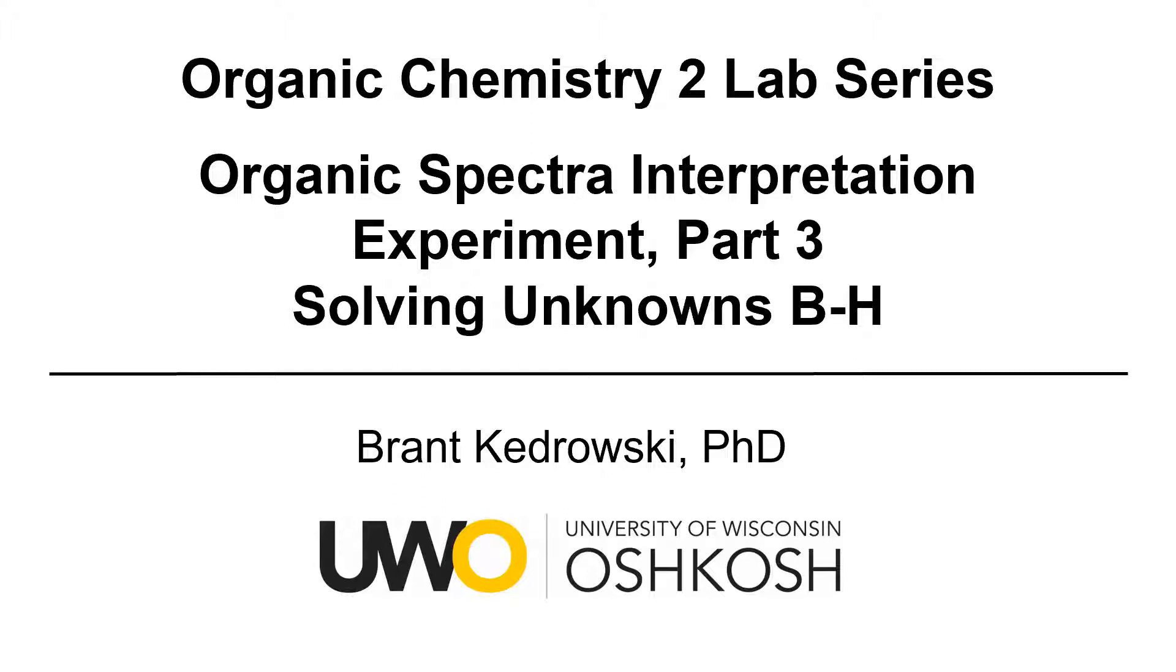In another video, I went through solving unknown A, going step by step through the interpretation of a mass spectrum, IR spectrum, proton NMR spectrum, and carbon-13 NMR spectrum, and then using those spectra to develop fragments of the molecule, and then putting those fragments together to generate a complete structure.